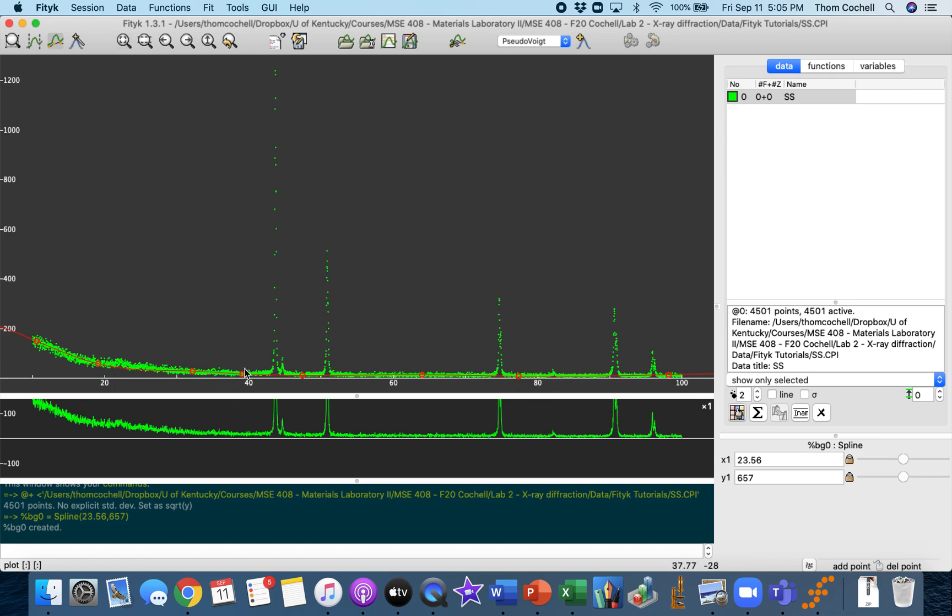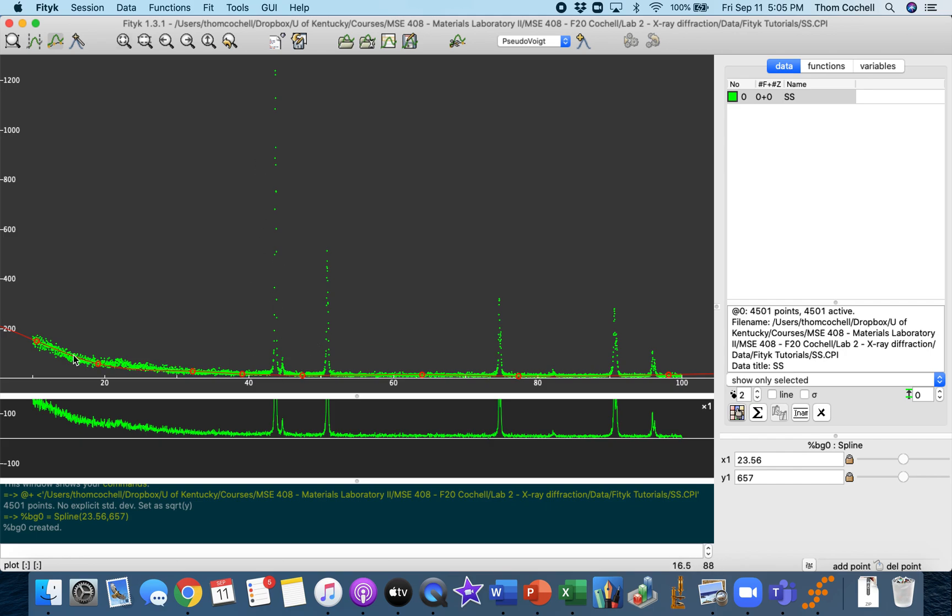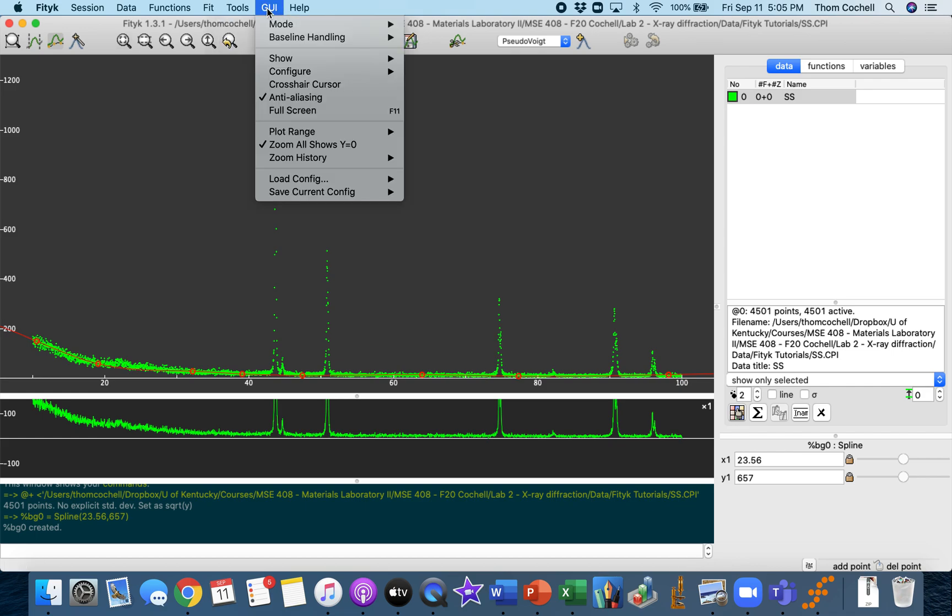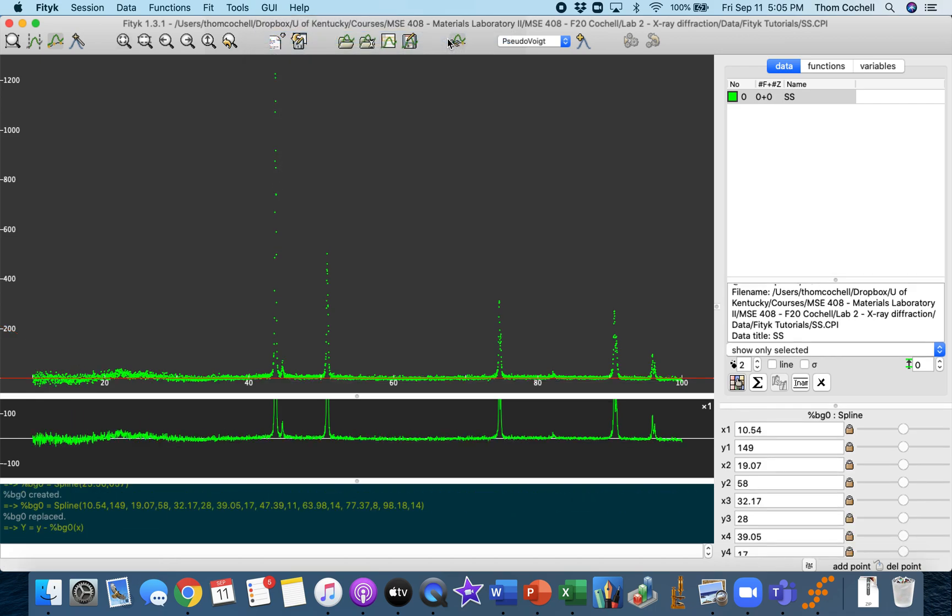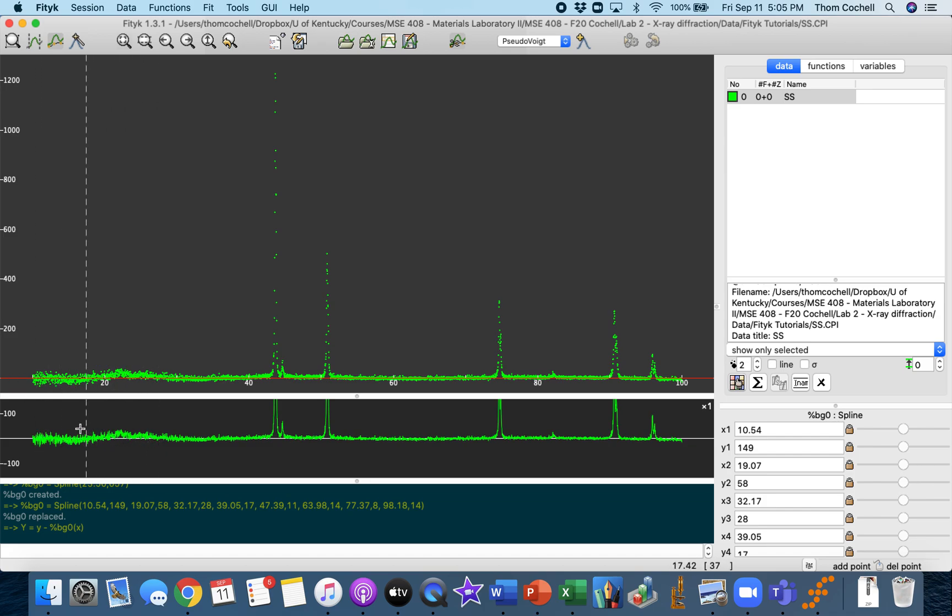The next step, once you're satisfied with this and making sure that it's not distorting any of these peaks, is to go up to the GUI and then baseline handling, and then you're going to subtract the baseline. There you can see that I've gotten rid of a lot of this noise—it's gone to zero as you might be able to see down here. You've basically made this flat and that's what you're trying to do. You just want to basically isolate and just look at these diffraction peaks; everything else is noise.